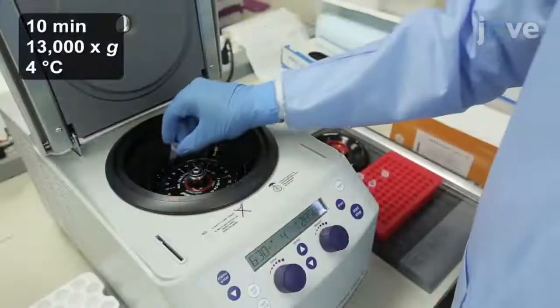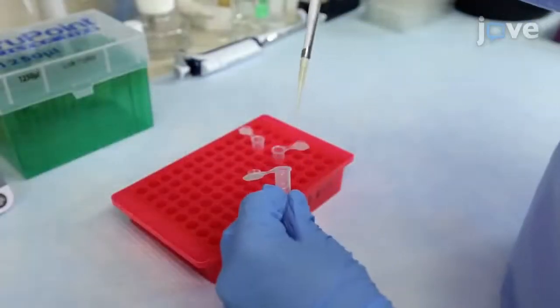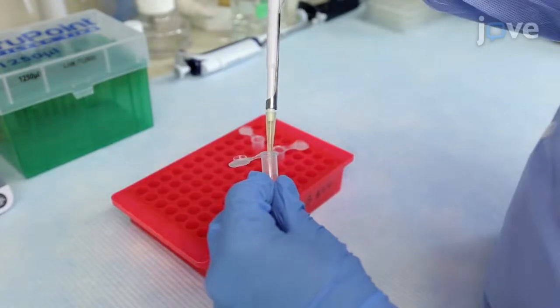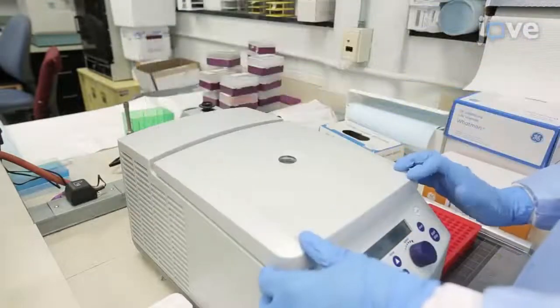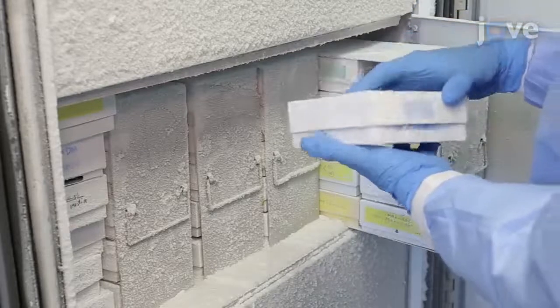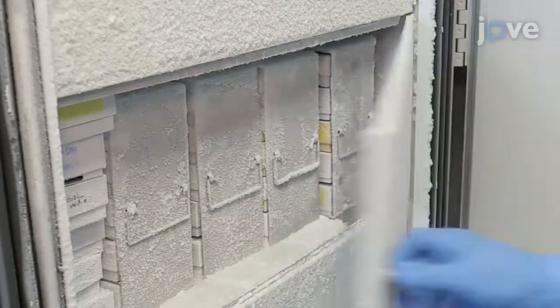At the end of the incubation, centrifuge the coagulated blood samples and transfer the clear serum from the top of each blood clot into a sterile 1.5 milliliter microcentrifuge tube. After a second centrifugation to remove any residual blood clot, transfer 50 microliters of serum into individual sterile 1.5 milliliter microcentrifuge tubes for storage at -80 degrees Celsius.